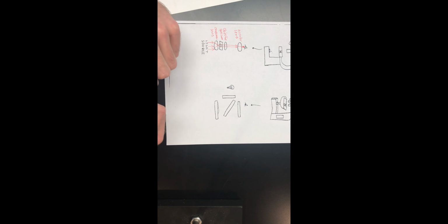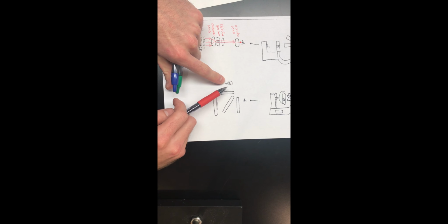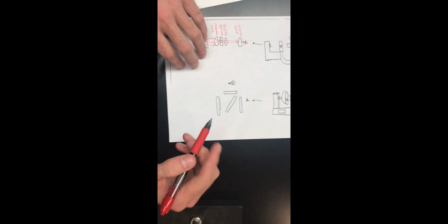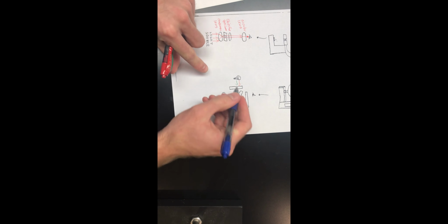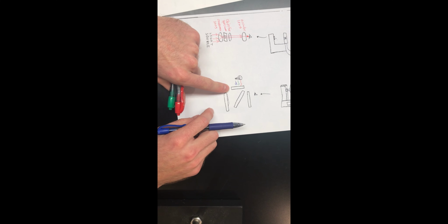So now moving on to the way this light is utilized in fluorescence microscopy, I'm going to assume that the light source is a mercury vapor lamp, just so I can show how these filter sets are used. This mercury vapor lamp is going to shine, let's just say, 3 different wavelengths of light onto this first filter.